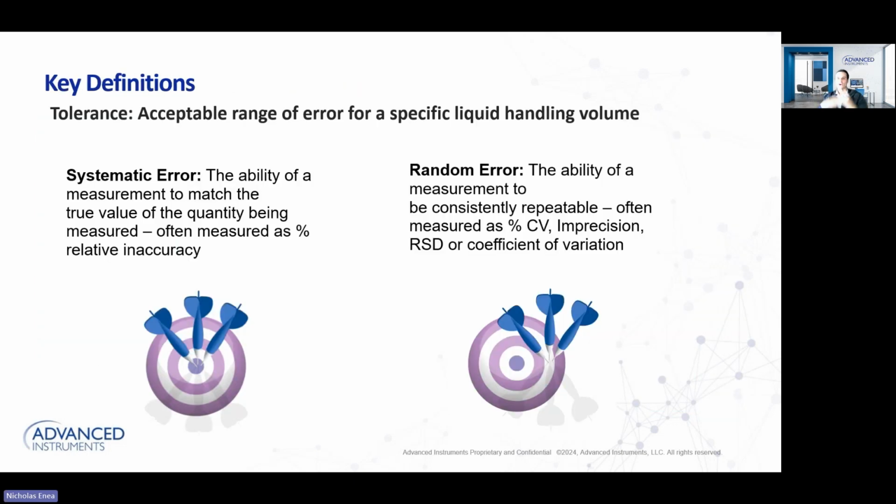Now let's talk about tolerances, and level set again on defining what these are, how we measure them, and how we work through these processes. These next three slides, I'm going to try to go really slow through. I always get lost myself, especially when I first started at Artel, because these terms continually change all the time. So we have great references that I'll mention throughout this presentation where you can go back.